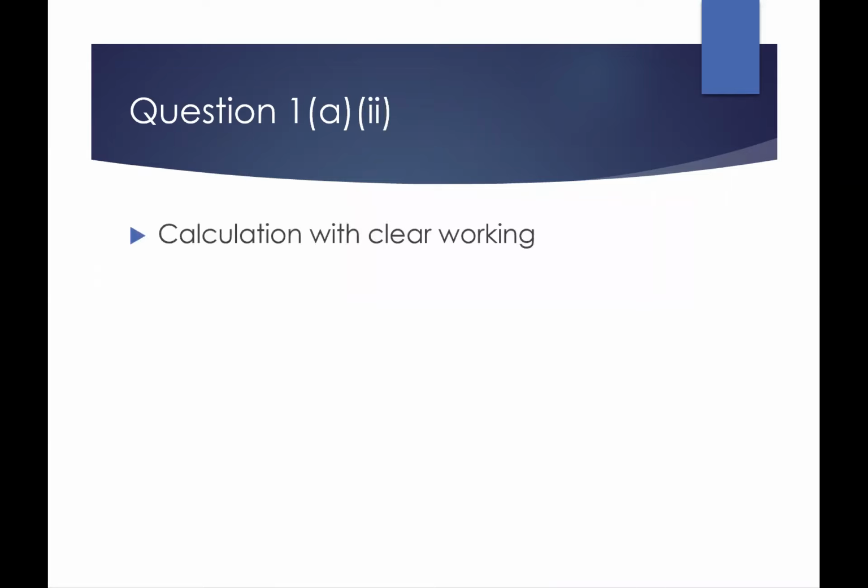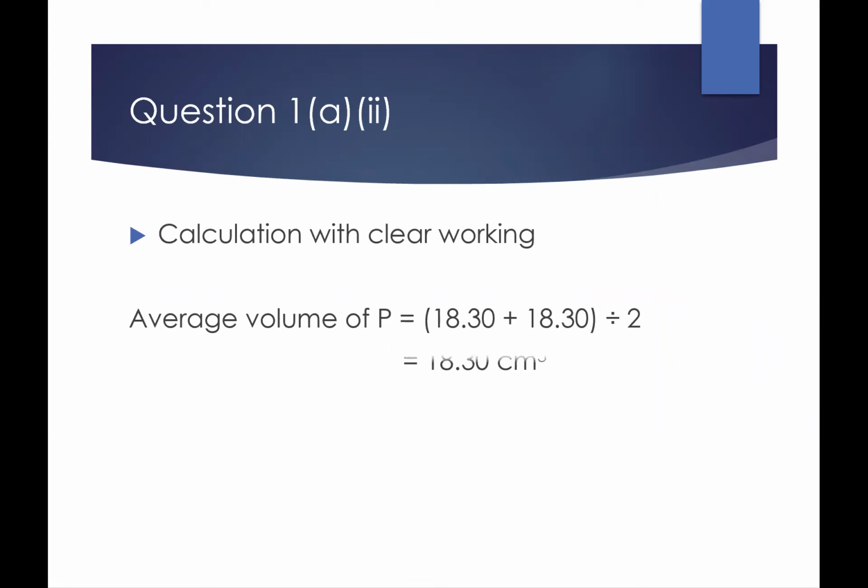Now, the second part will be calculation. Okay, so your calculation has to include clear working as stated in your question. And this is just your usual calculation of the average volume. And again, your answer should be correct to 2 decimal places.